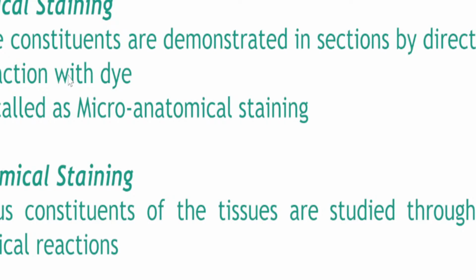Yung pawis kasi ni Mel nag-react doon sa clear na likido na nilagay ko, di ba? So sir, is it true na all histochemical stains are clear colored? Well, not really, not all of them. Sometimes they could be different colors that change color once a particular type of cancer is detected, mga ganon, okay?